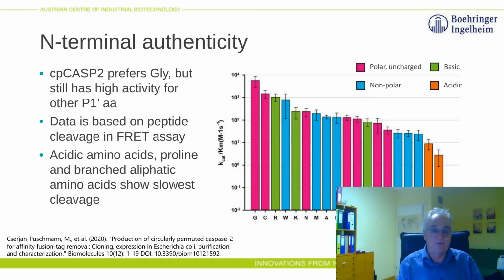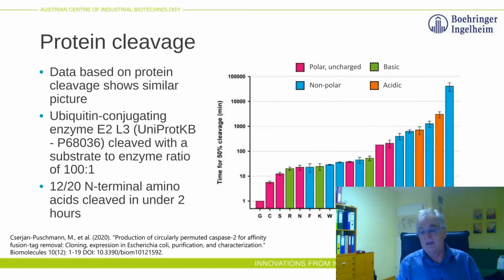When we do bioprocessing, we are actually more interested in the time. And here we have plotted the same thing, but as the time for 50% cleavage.